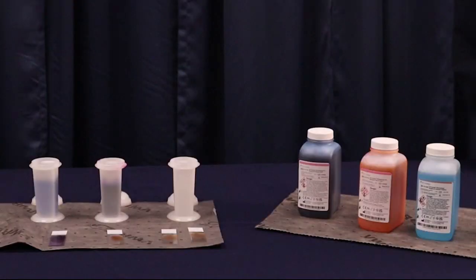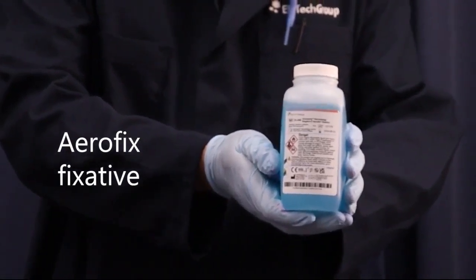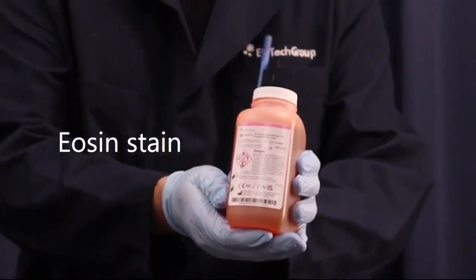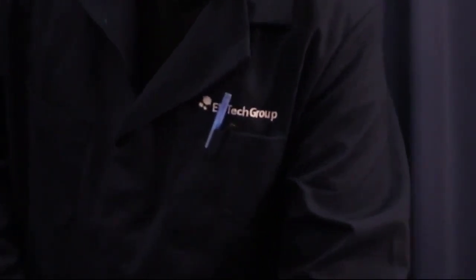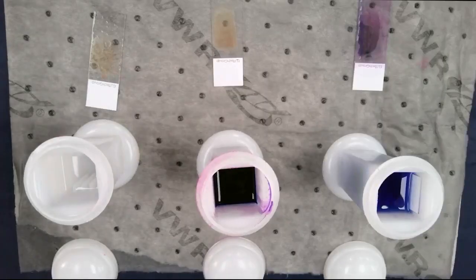Here's an example hand staining setup for blood smears. One can use Elitech's Aerofix as a fixative, the red dye eosin, and finally the blue thiazine dye for staining. Here's a top-down view of the staining setup.